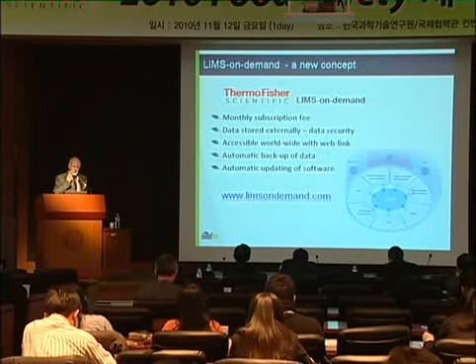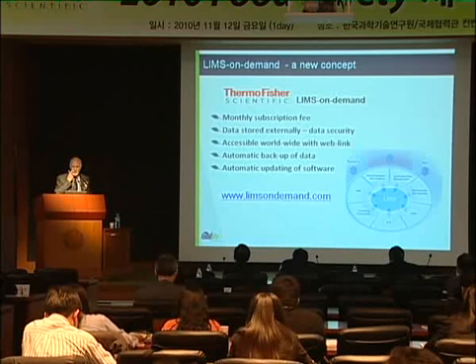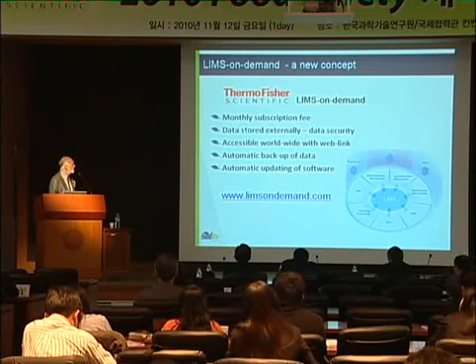So LIMS on demand is a little bit different from normal LIMS systems. You don't make a capital investment to purchase the LIMS system. You're effectively leasing or renting through a monthly subscription fee. So you don't have to make a big capital investment, just a monthly leasing fee. This has a number of advantages.